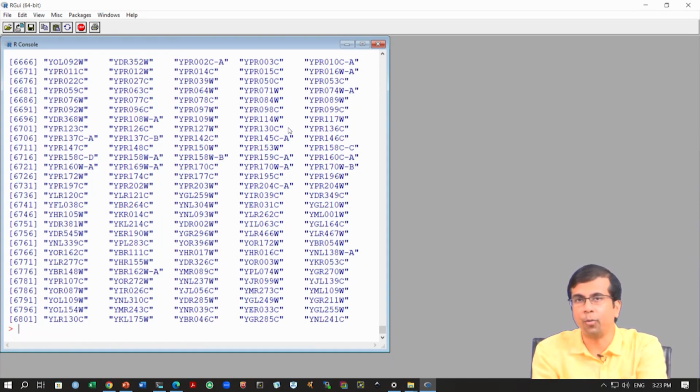If you do not have your own data, I will show you in the next class where we can download this data, and we can try these different things on it. If you have your own data, definitely try to load it and start working on it. In the next class we will do a bit more on this data set. Since we have loaded it now, we can do a lot of things, and I will also show you how to load the packages that will be required for our analysis. So, that is it for this class, and thank you.